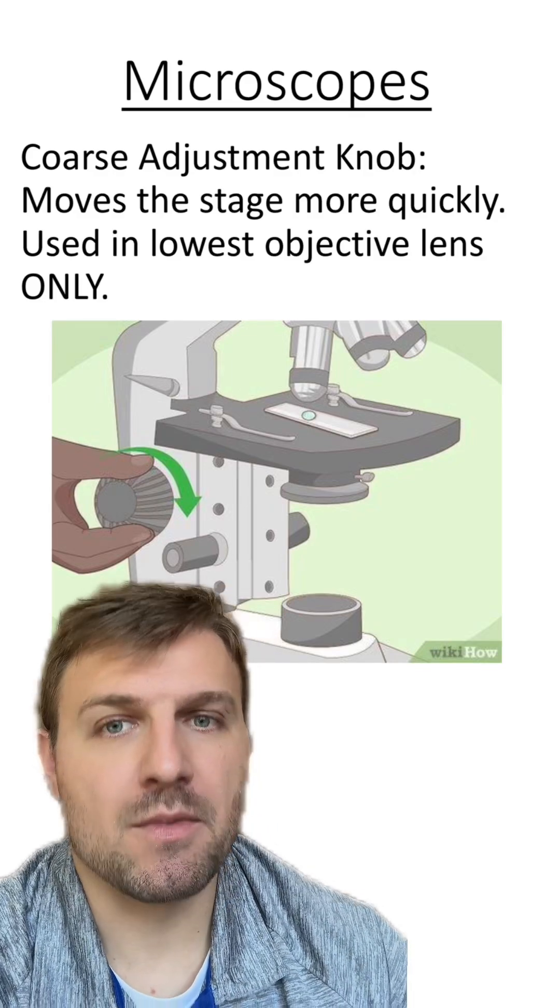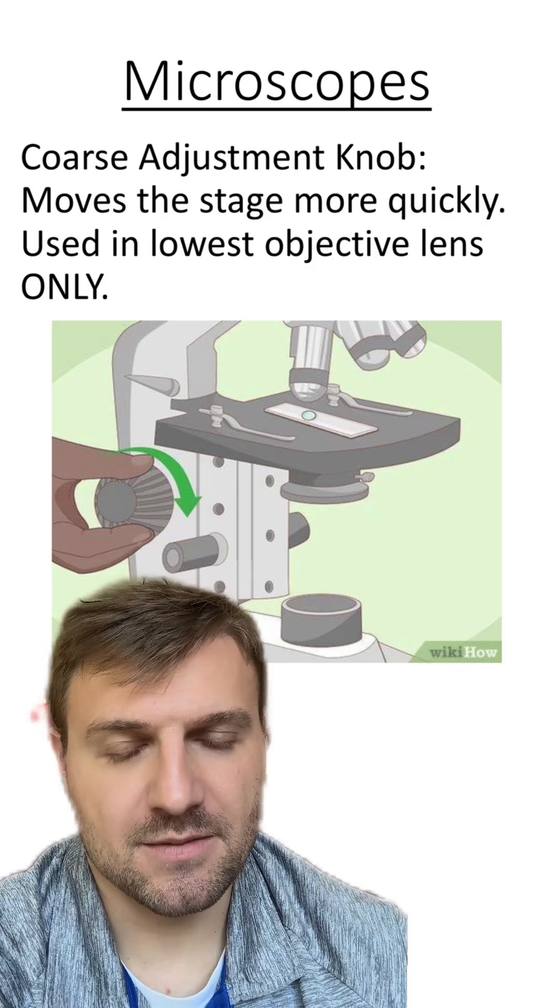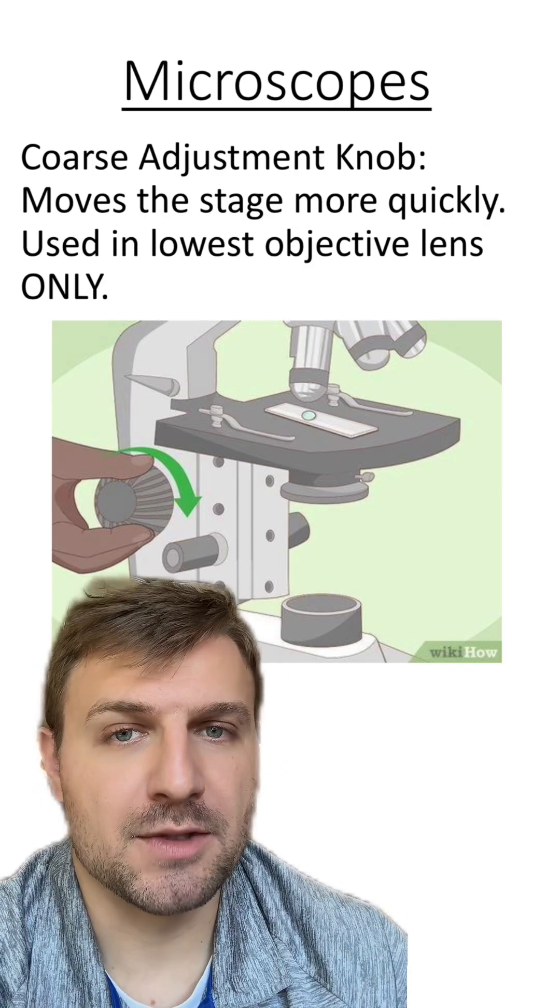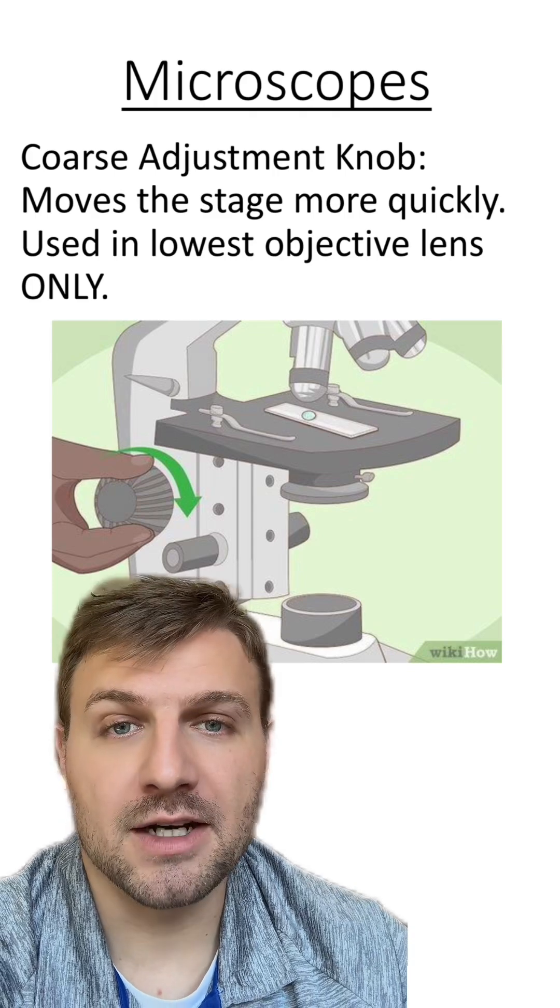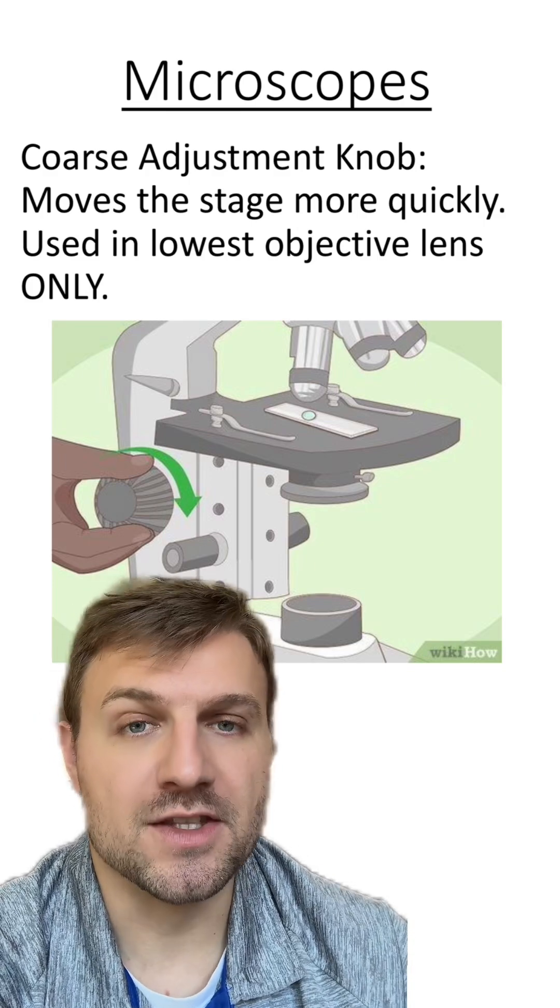Now, it's really important to remember that you only use the coarse adjustment knob on the lowest objective lens. If you use the coarse adjustment knob on the medium or high magnification lenses, you might damage the lenses, since how fast it moves the stage up and down.